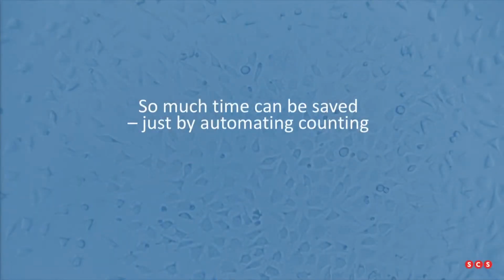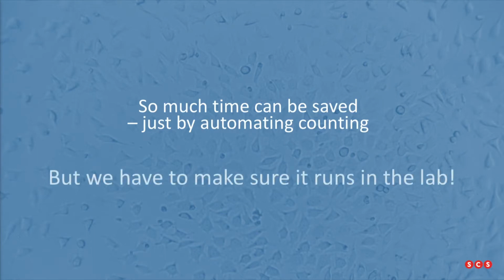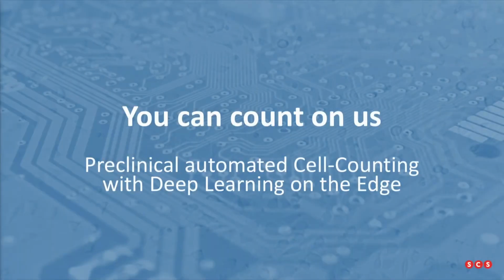And you wouldn't believe it, that's something that's often still done manually, actually. So what I wanted to present is that so much time can be saved just by automating the counting of those cells. But the critical point is we have to make sure it runs in any lab that actually wants to count these cells. With that, I'd like to welcome you to my talk. You can count on us. Preclinical automated cell counting with deep learning on the edge.